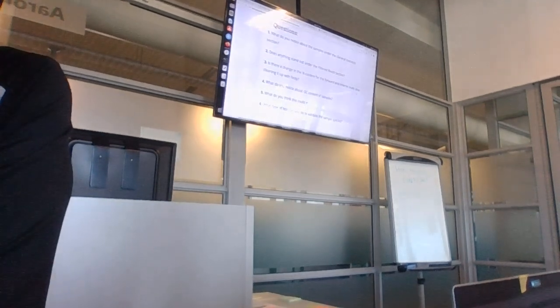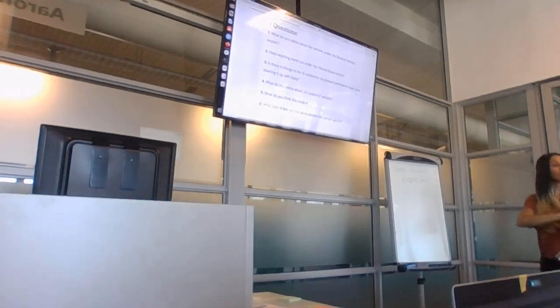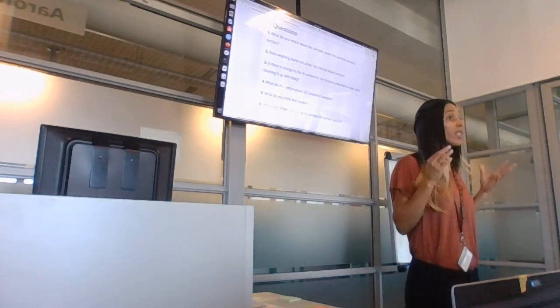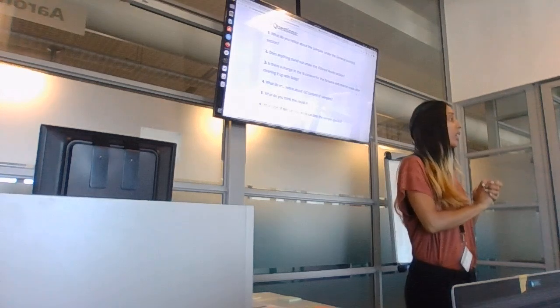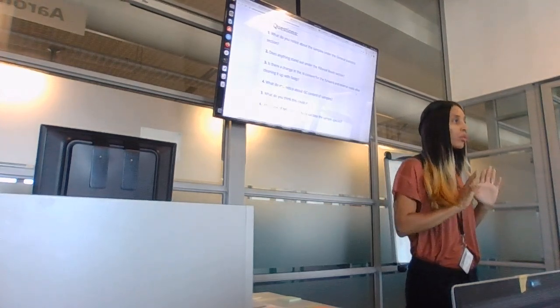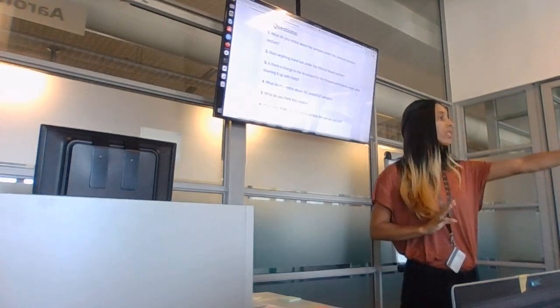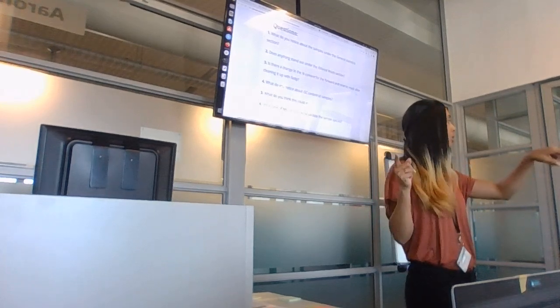Oh, okay. By the way, just so you know, a good thing came up. When you're building a workflow and you're in a hurry, let's say you're going to present now and you want to build a workflow in the next 5 minutes, you don't have to wait for the one tool to finish to select the other one. Her fastp is still running. She can already tell it when it's done, run MultiQC.